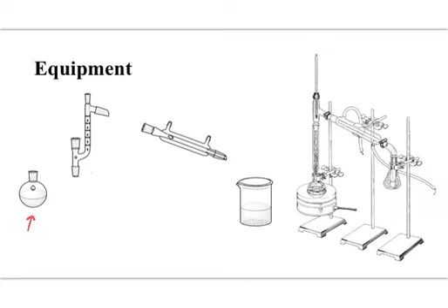You're going to have some kind of distillation column. All right, so this is your distillation column, round bottom flask. And this will be some kind of distillation column. Might not look exactly like this, but we need some distance to provide ample time for heating of the material, have it go up, and make sure that we're only distilling out the cyclohexene. We're going to have some kind of a condenser.